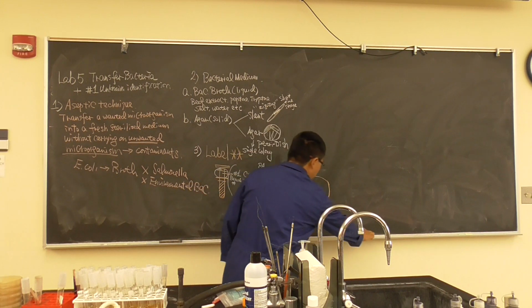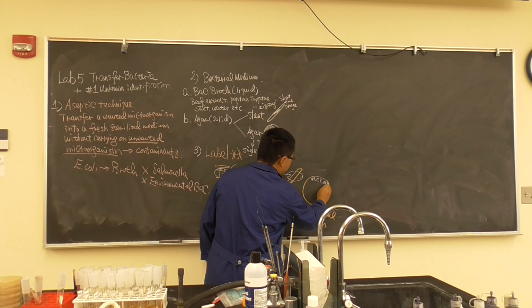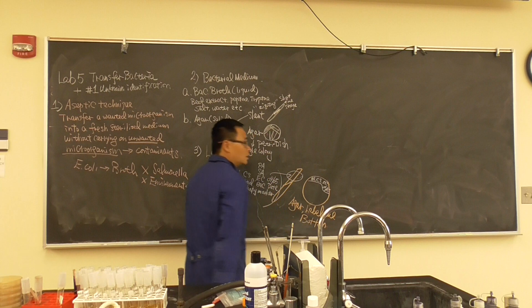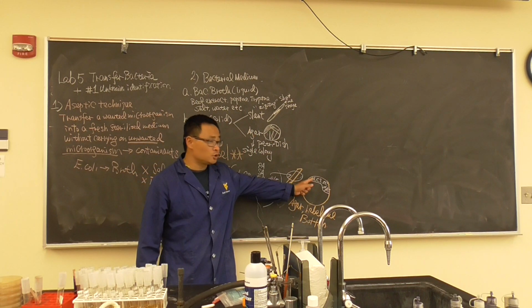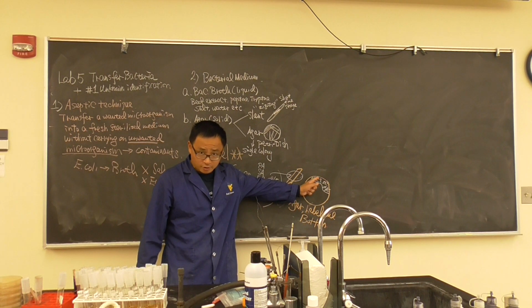What information are you going to put there? Bench number, initial, bacterial name, and date. Very simple, right on the corner. Now here is the thing, this is going to be your bench number. I just give you an example. Not everybody writes their initial as CS. That's my initial.